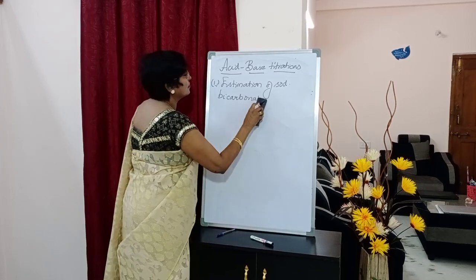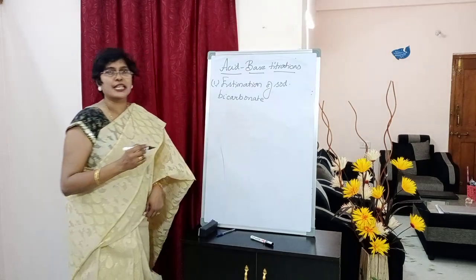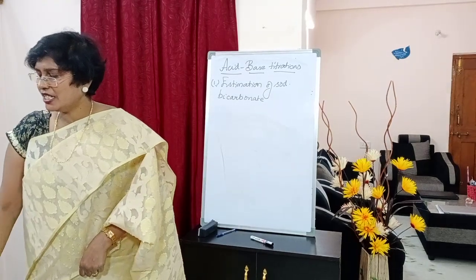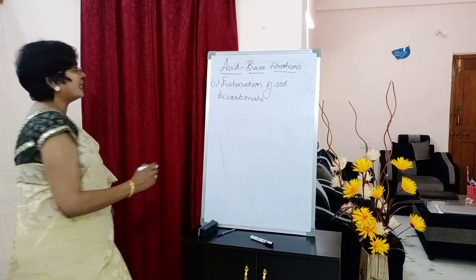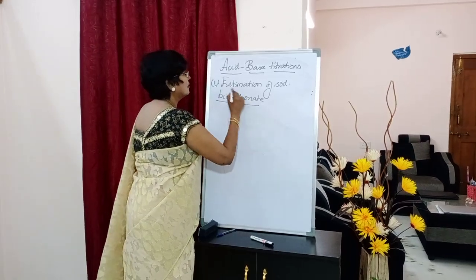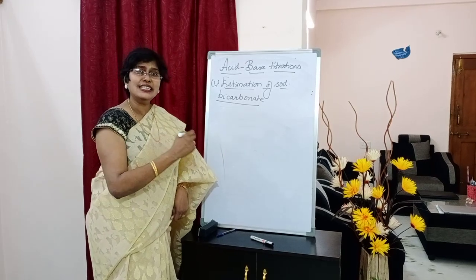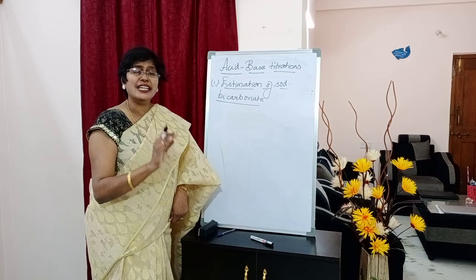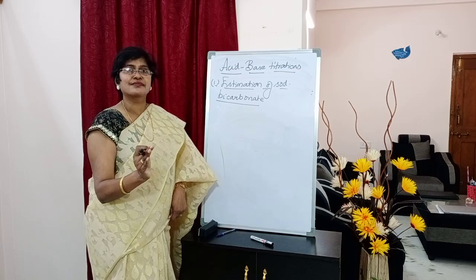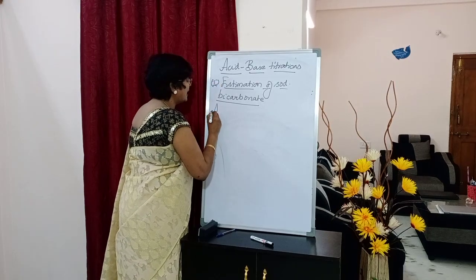Put the heading, students: Estimation of sodium bicarbonate. You have to write all this theoretical part in your observation notebook. It is mandatory.